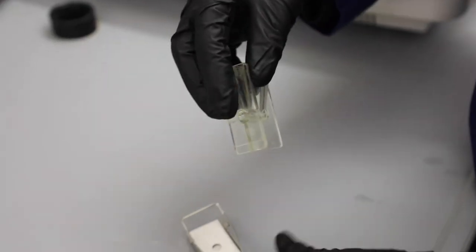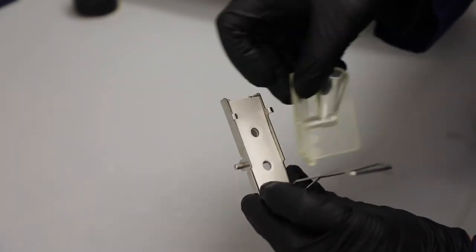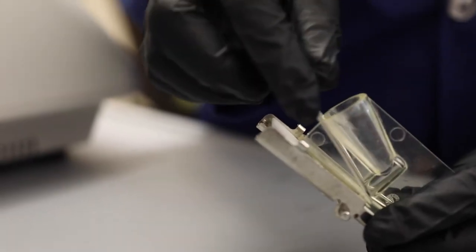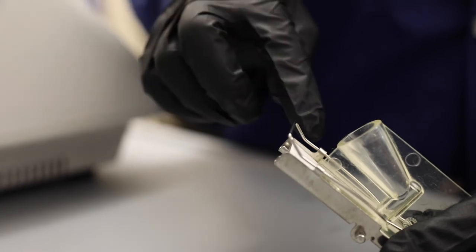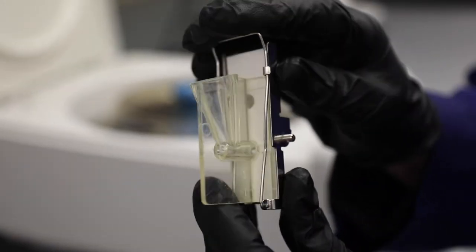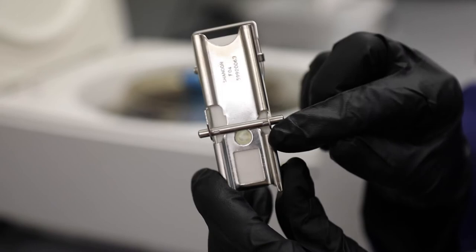Next, put the funnel on top of the filter so that it opens into the hole. Finally, lower and clasp the clamp on the cassette. Double-check that all parts are aligned so that no parts of the holes cover each other.